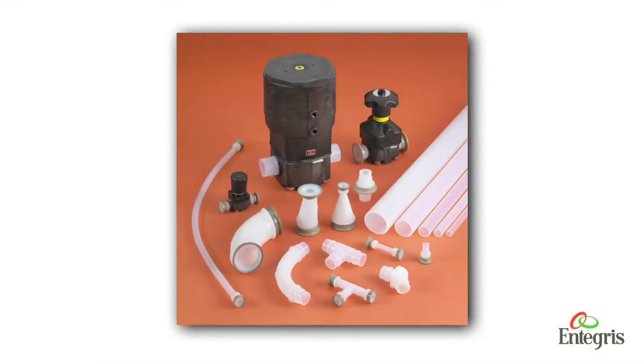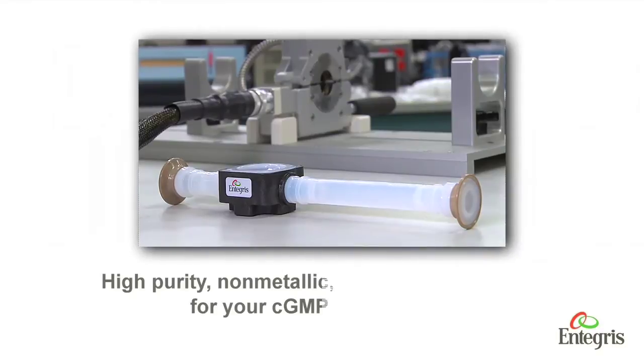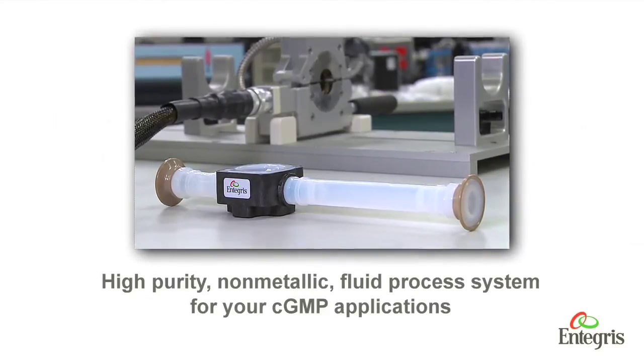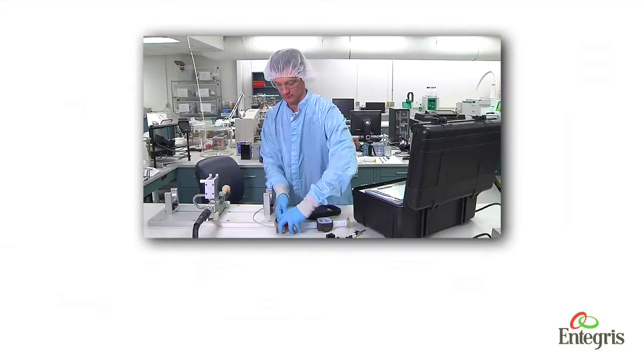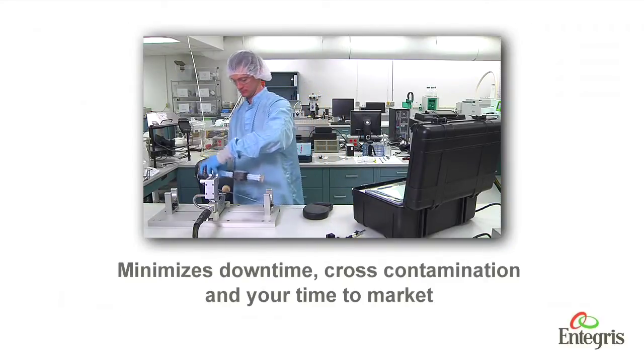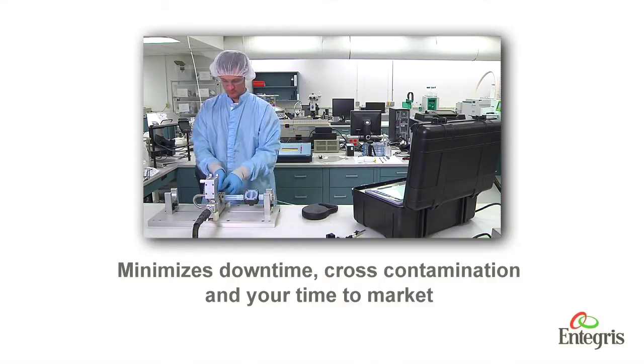Discover the corrosion-resistant, chemically inert, and easy-to-clean Synergy Sanitary PFA components. Now there's a high-purity, non-metallic fluid process system for your CGMP applications. The Synergy system minimizes downtime, cross-contamination, and your time to market.